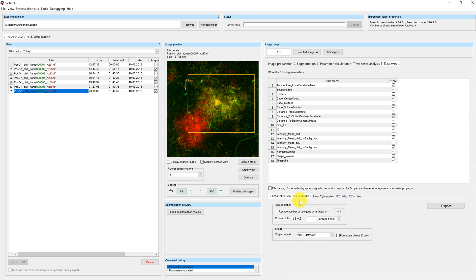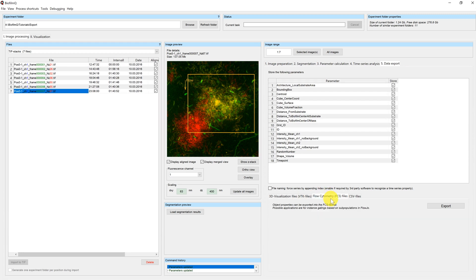At the bottom you have three different tabs for three different output types. You can create 3D visualization files, flow cytometry standard files, and CSV files which can be opened by any default spreadsheet software.